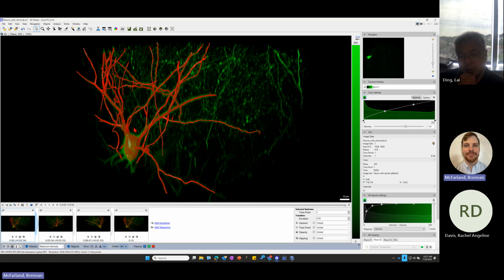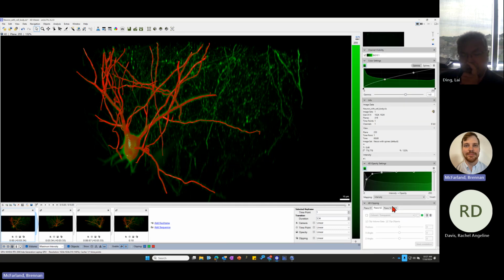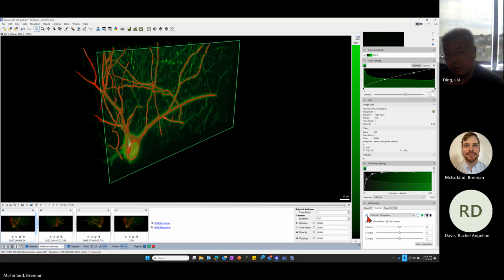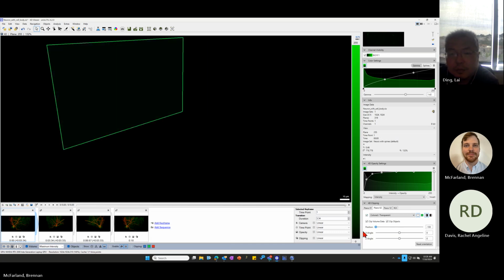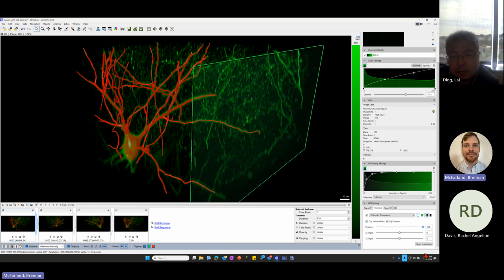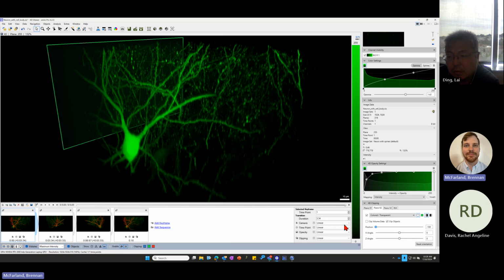So maybe you would want to start off with your data like this. Maybe we can then turn this off, and get rid of these objects here.